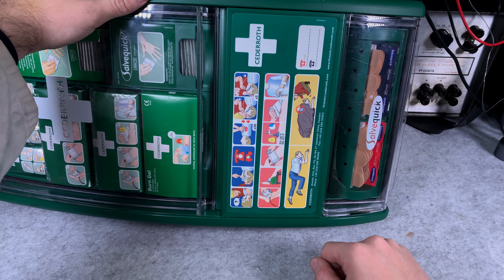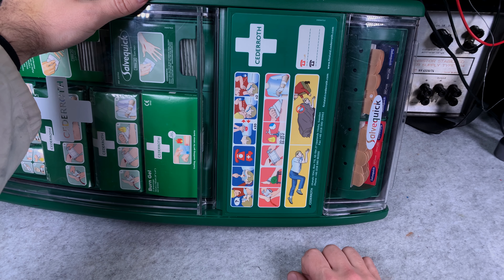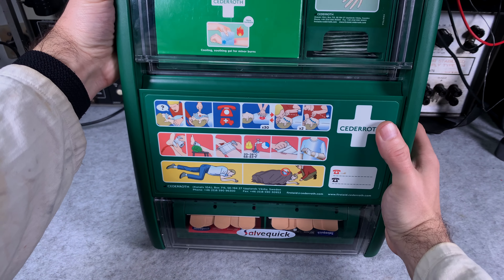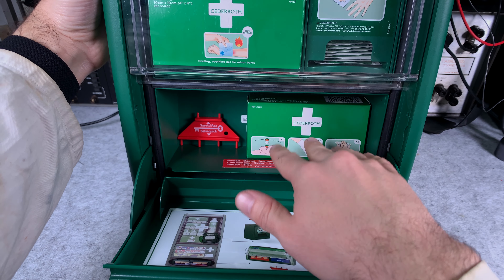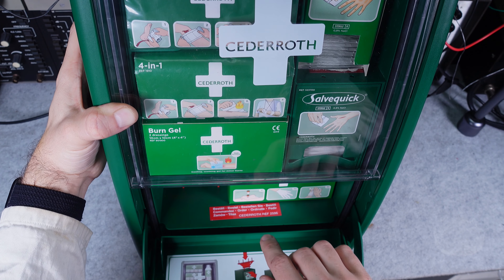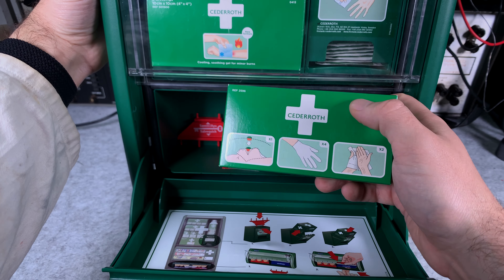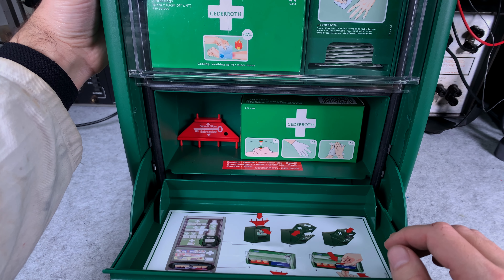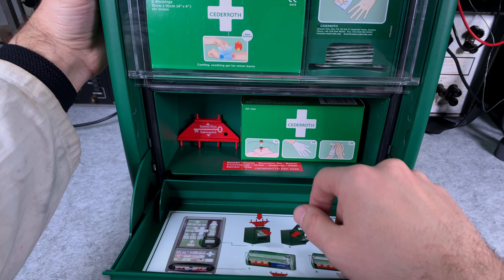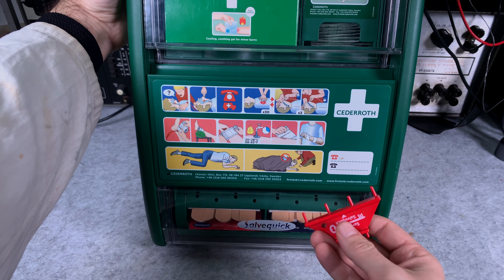Here you can see first aid instructions — they are just pictograms and they describe what to do, so no matter which language you use they are pretty universal. That compartment is really nice because you can store items from a different company there if something doesn't fit into the designated spots. In my case I've got a mouth-to-mouth kit: a mouth mask, gloves, and decontamination wipes.